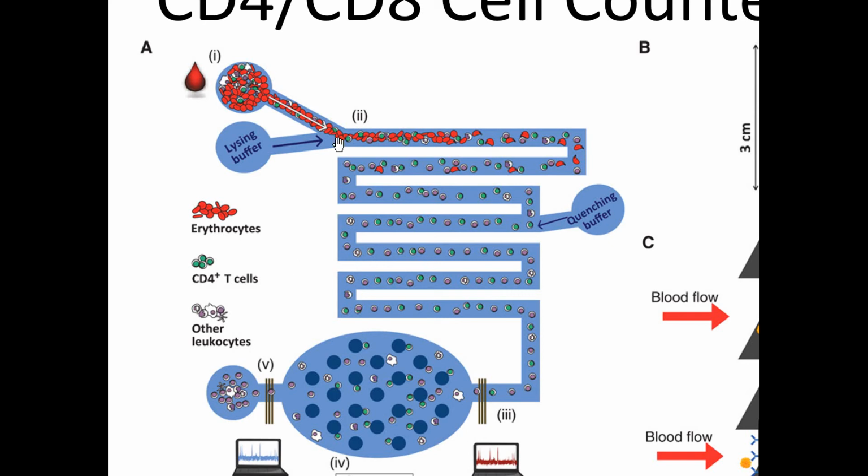They add the lysing buffer here, and then they run these components through a microfluidic channel. As these things are flowing through the channel, they exist in that channel for a very specific amount of time. Now here's something that happens. If you keep the lysing buffer in there for too long, all the cells will lyse. So you want to keep the lysing buffer in there for a very specific amount of time.